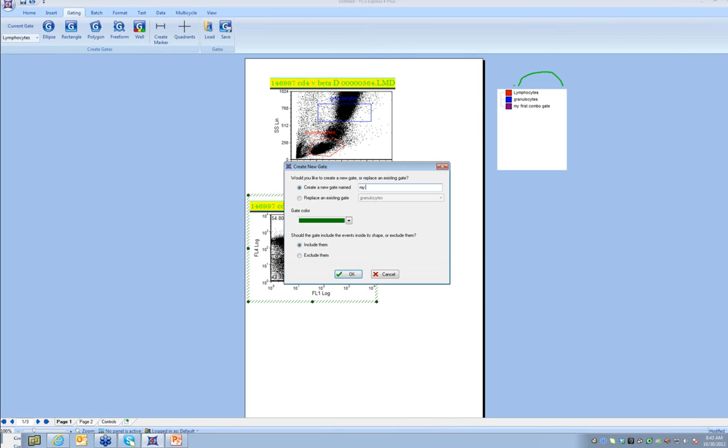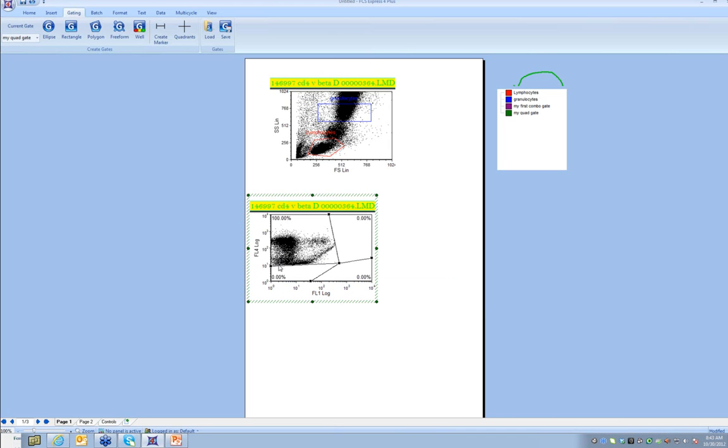And it maintains that even if you switch to our floating quadrants, which you can do by going to the quad section of the format screen. The floating quadrants are very nice because you can make your quads on angles, and the gates will remember the shape of the way the quads are defined. So you can gate on quadrants, and over here in the gate view you can drag the quads above or below. They can be children or parents of any other gate that you've created.